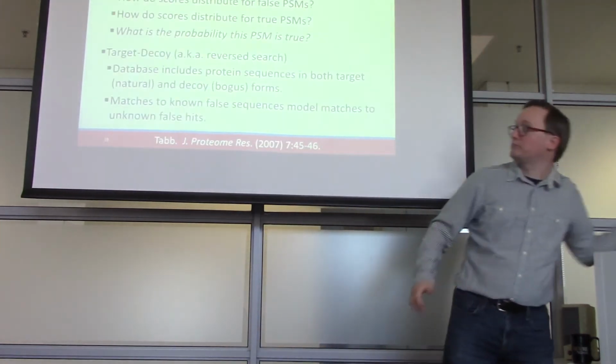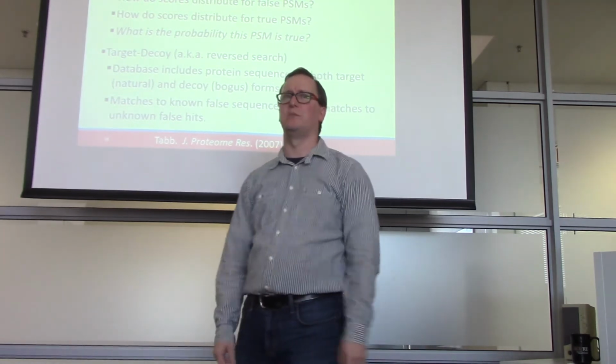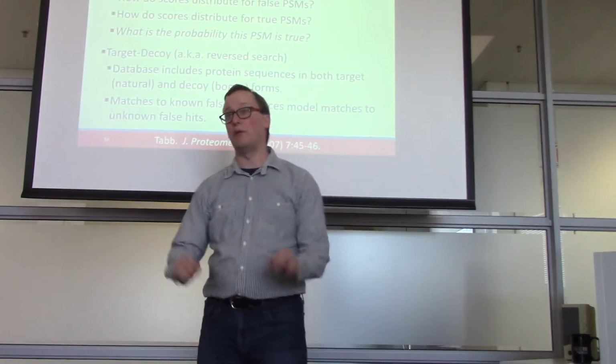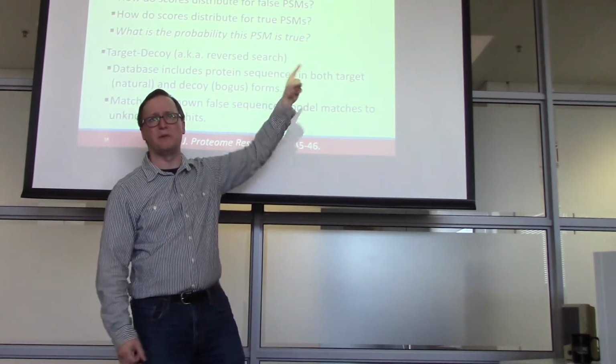Okay. So, how do we control PSM error? PSM is a term that gets thrown around a lot, so I want to make sure that I help define it for you. A PSM is a peptide spectrum match.